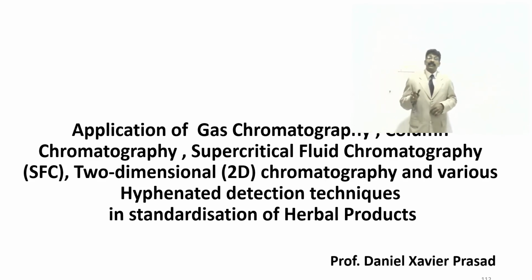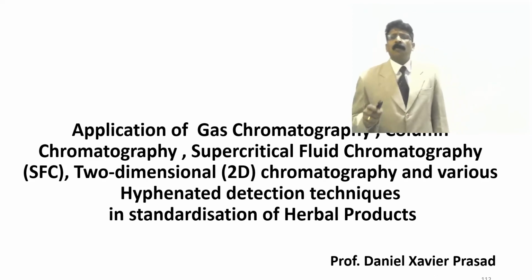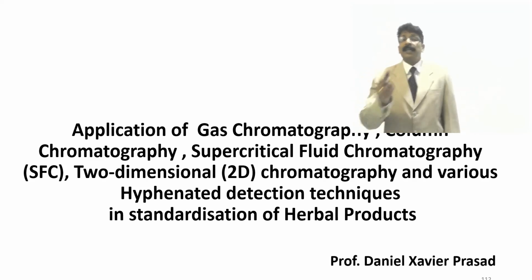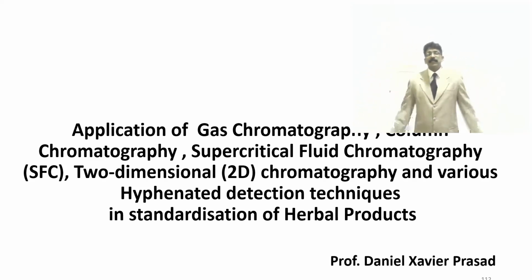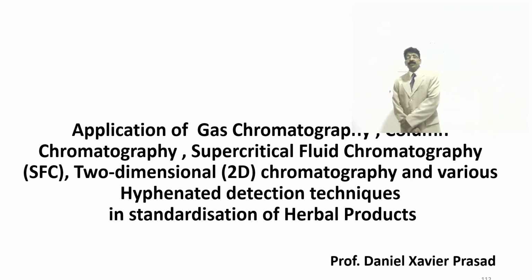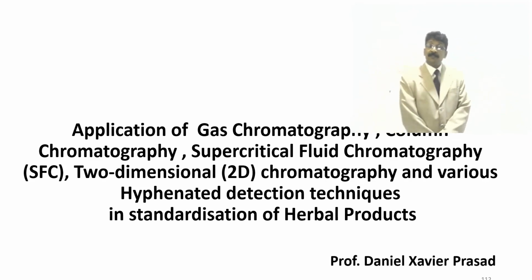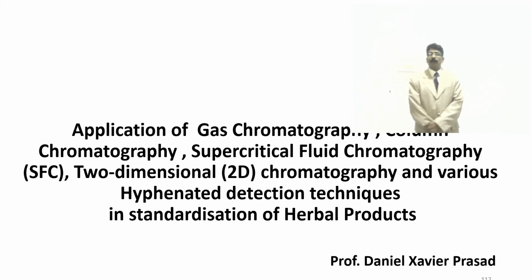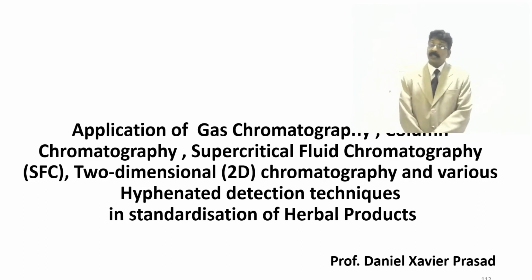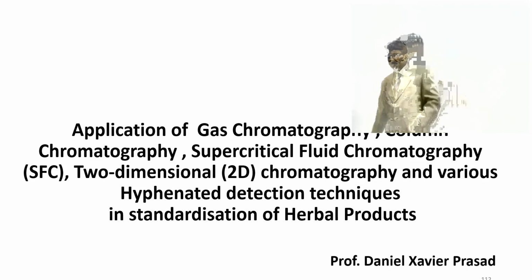Hyphenated techniques are nowadays more common, and have application in various sectors, not only in herbal drug technology, herbal formulation or identification of drugs, qualitative and quantitative analysis of formulations and herbs, but also in various other technologies.